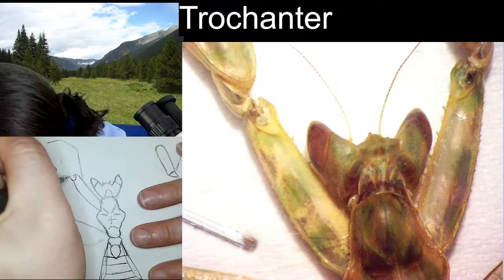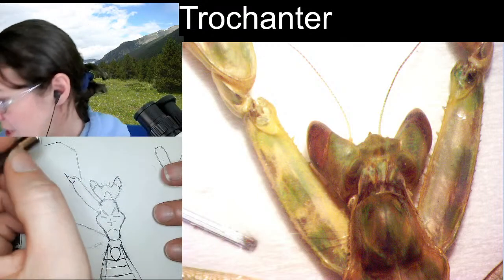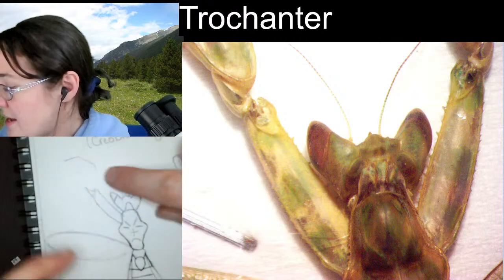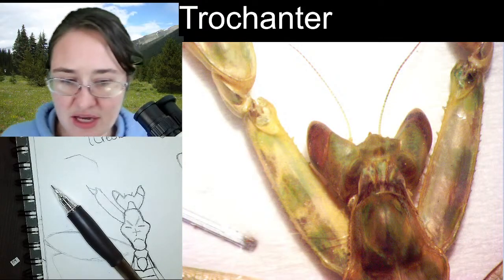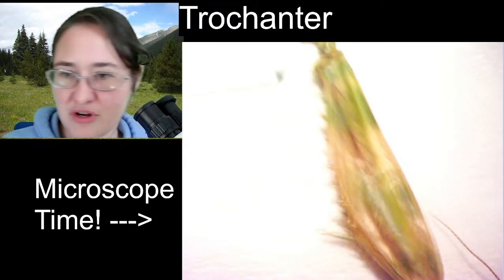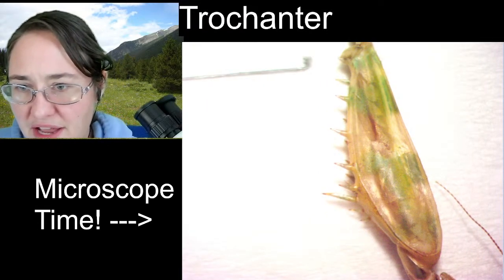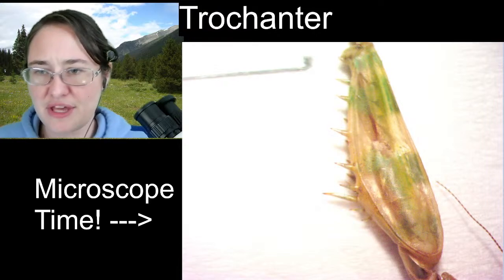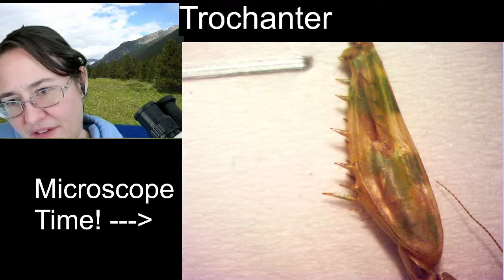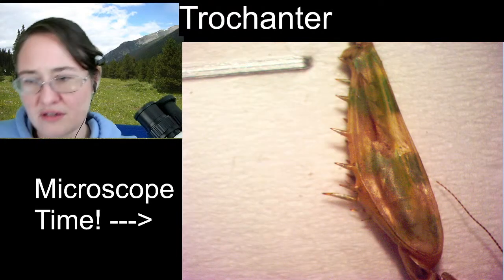All right. So we've got a trochanter here. Now, the femur is the next segment, and I'm making it a little bit wider. So let's go ahead and move our specimen just a little bit. Just a skosh. I wonder how much we can see. Here we are. Two things to note about the femur. Let me see if I darken it, you can see the spines a little bit better. They don't get flared out.